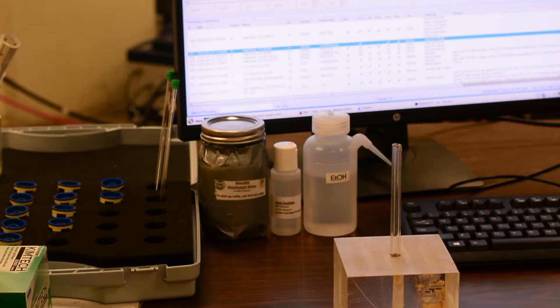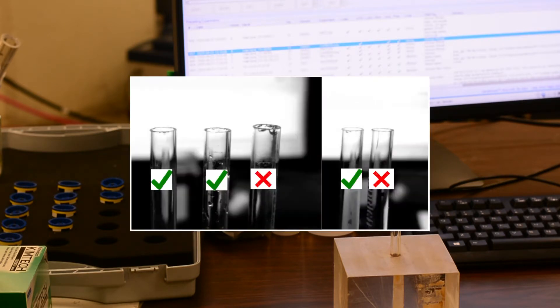One of the most important components of generating high-quality NMR data is good sample preparation. There are several components to this. The first is making sure that your NMR tube is not cracked, chipped, or warped.